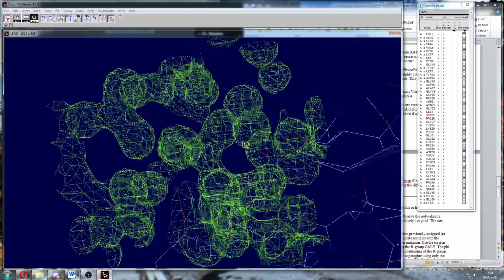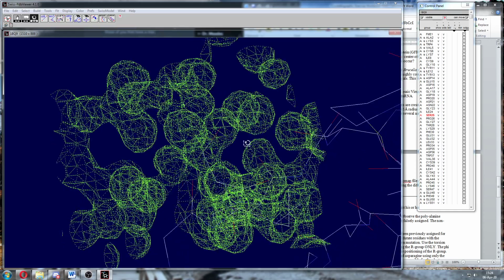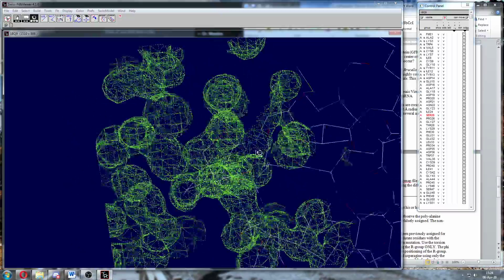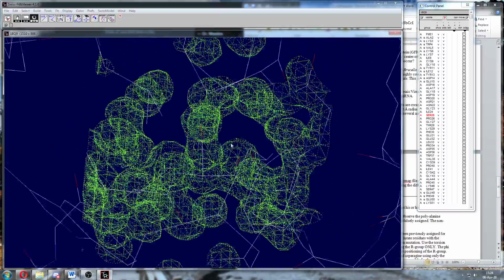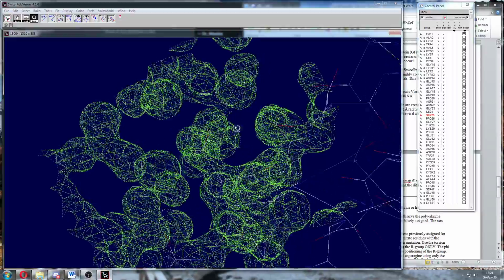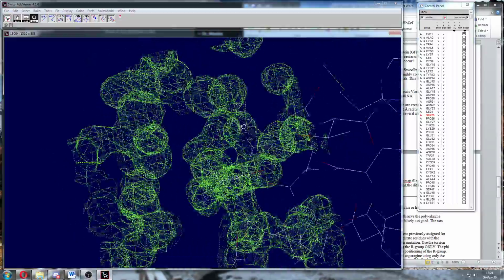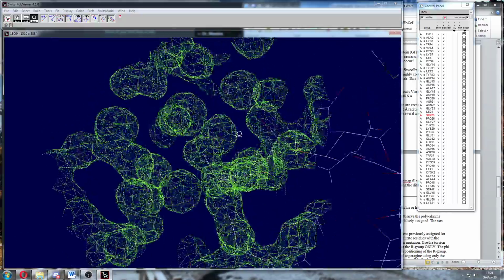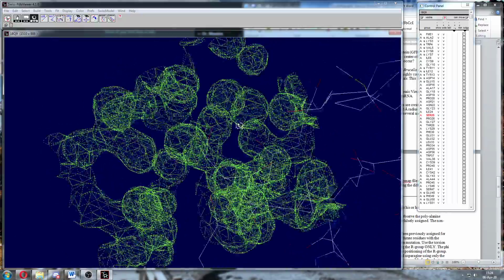I agree. But in electron density structures, you can't see hydrogens. So water would look like a single sphere for an oxygen. Sometimes you may see the little mouse ears where the hydrogens are often located, but most times they're tumbling so it looks like a sphere. So those are water molecules. Don't let them confuse you if you see a bunch of spheres without density in them. If they're not connected to anything else, they're most likely water molecules.